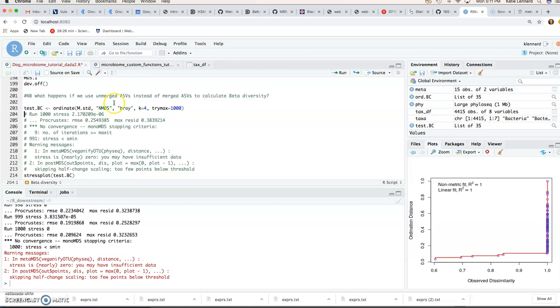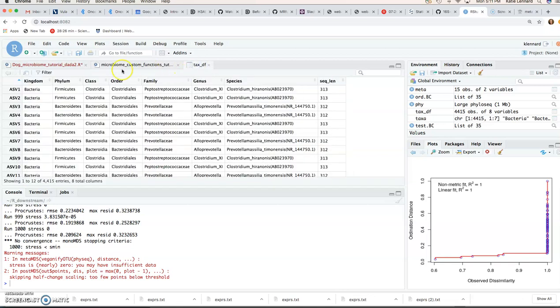Had you instead used UniFrac distance here, which includes the phylogenetic information, this would have been a different story as then you don't have the case where we discussed that you have several ASVs that have the same species level annotation, that are considered as separate entities by the algorithm.